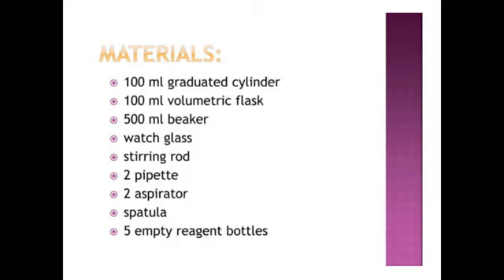You will need an aspirator, or sometimes you can also need a spatula to take the measurement of the base, which is in solid form. You will need an empty reagent bottle, and the reagent bottle is generally to house the prepared standard solution.